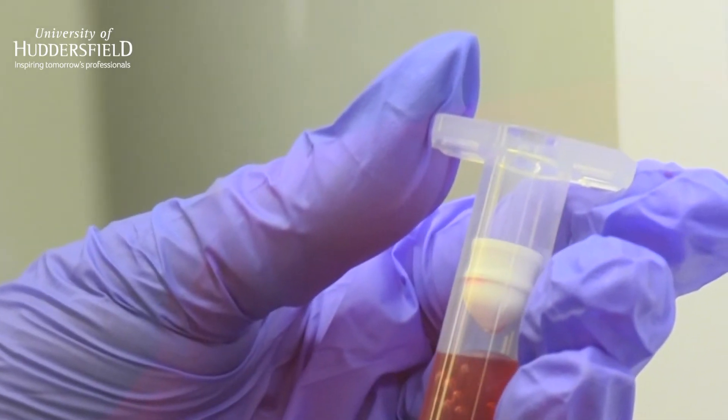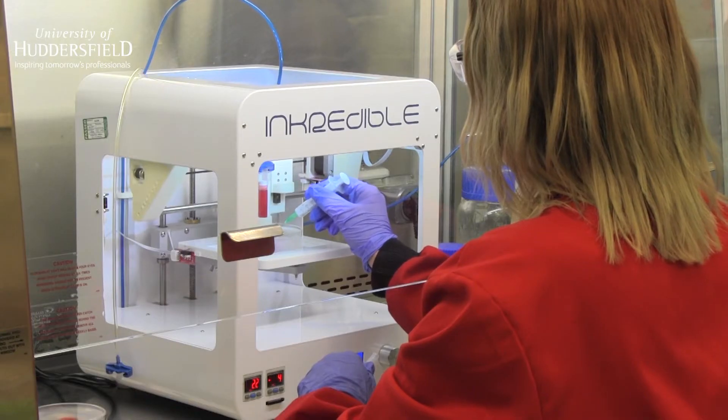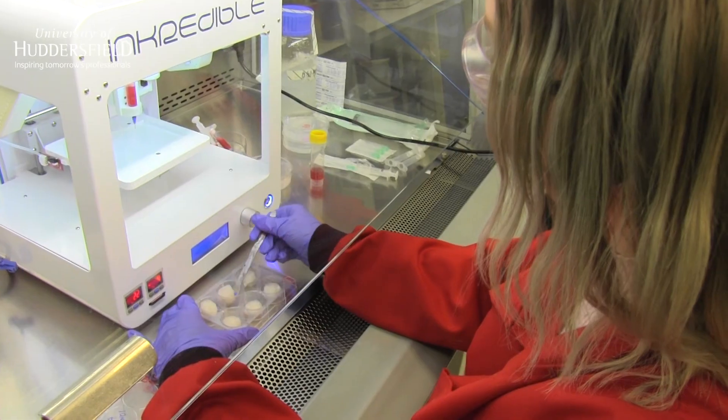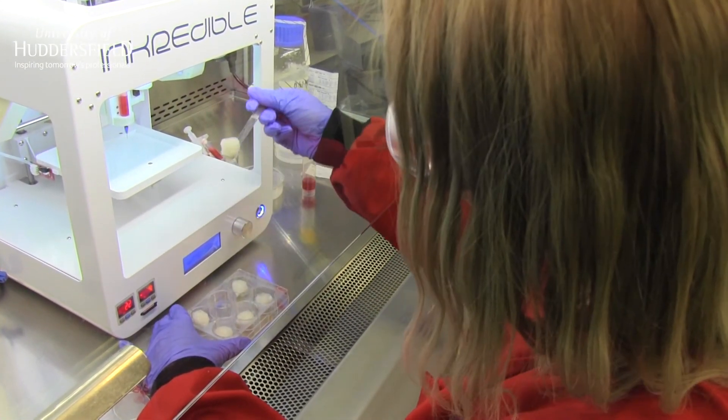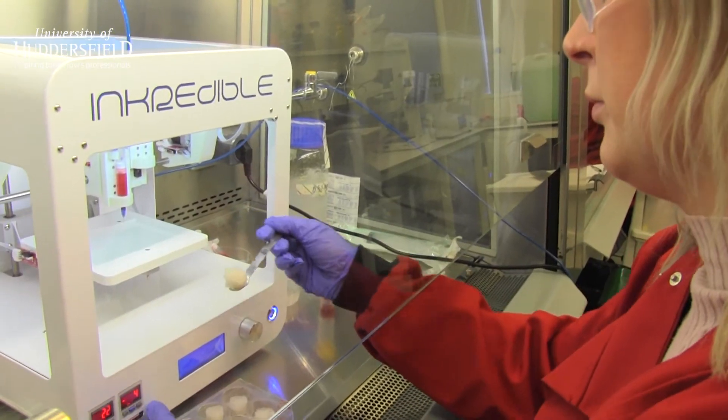Once the structure has been solidified, the gel can simply be washed away and the scaffold extracted. This technique also allows us to incorporate multiple materials into a single construct with regional mechanical properties that mimic those found in human tissues.